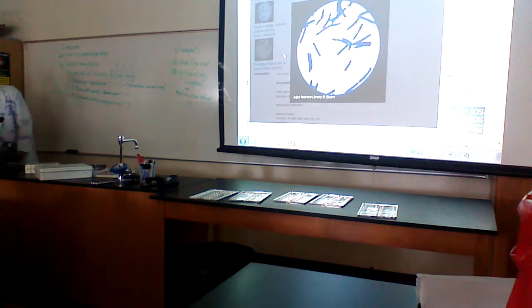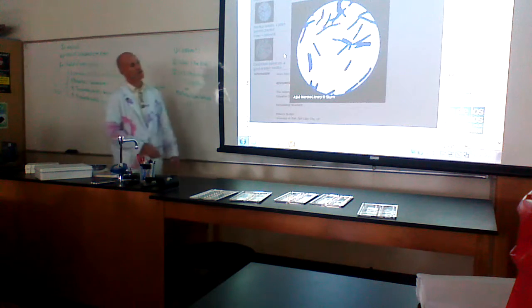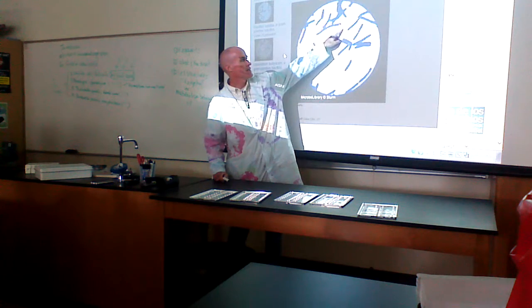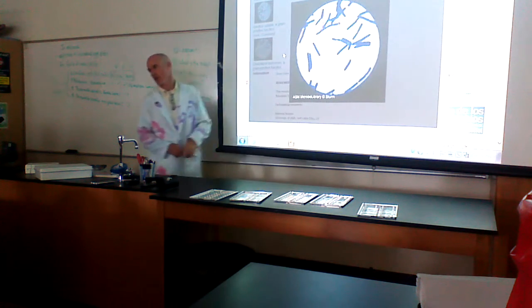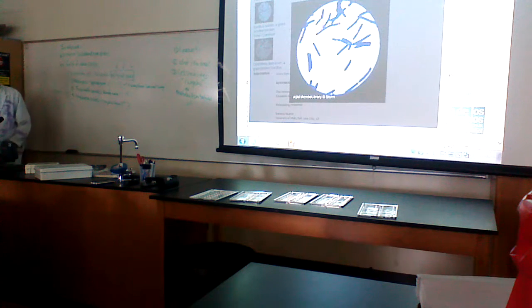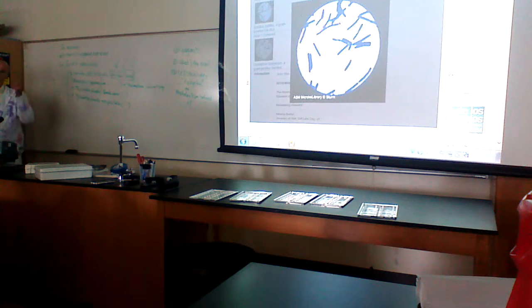This is actually one where you're getting both. It's one species with variability. So this is gram positive. The gram negative is kind of a reddish, pinkish color. Gram negative, right? So the question is going to be, it's going to be a scope.